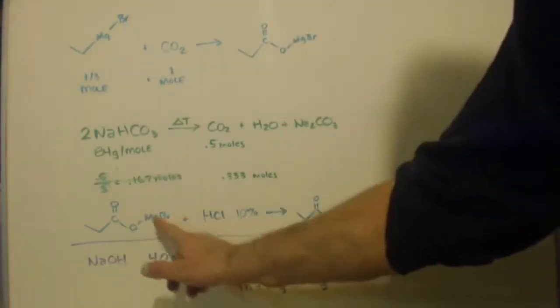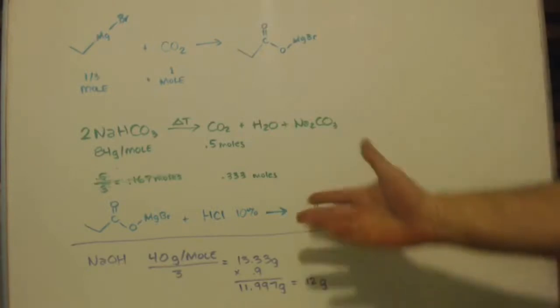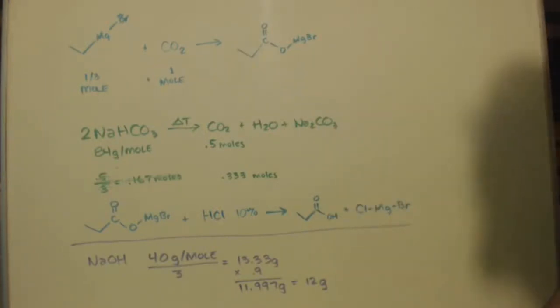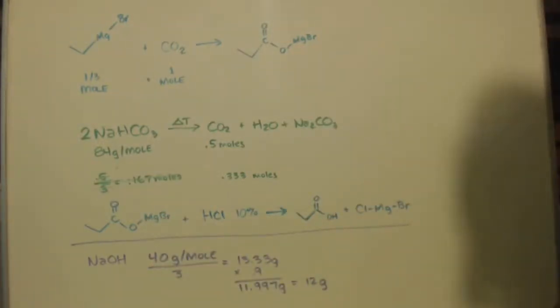It's the same thing, it's a salt of this propanoate. So a third was to help get rid of some of the magnesium that was in there, and a third was just to wash it. Then I used sodium hydroxide to take the acid and turn it back into a salt, but not this freak salt, a normal salt that we know, like sodium propanoate.